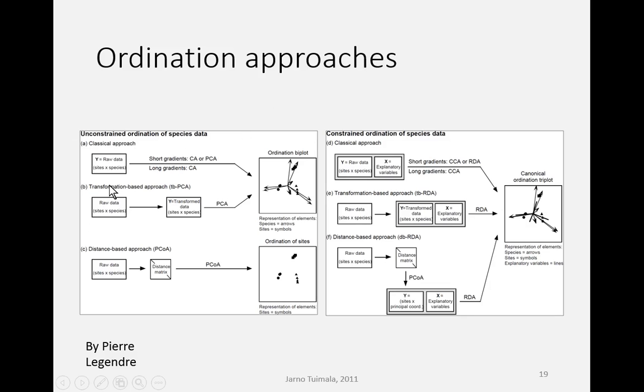Yeah, well, the basic difference is that this is PCA here, or here. You just have the raw data, or sites times species matrix. So you have this count table that you already saw in Chipster, and this is what you use for analysis, basically. It gives you this kind of similar looking ordination biplot. Whereas in this constrained analysis, or RDA, you also take into account the explanatory variables, so variables that you measured from these sites, whatever those sites are.